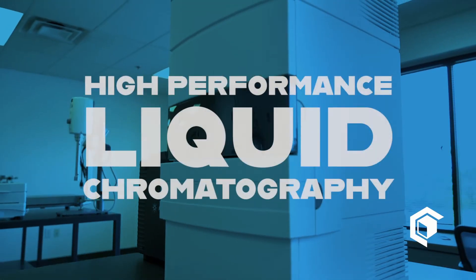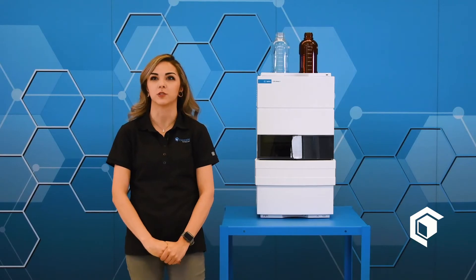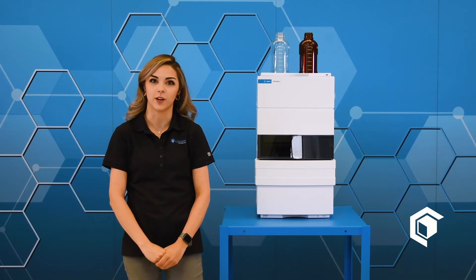The Agilent 1220 is a high-performance liquid chromatography system. Most labs prefer this method over gas chromatography because it doesn't require any heating and it provides more accurate content analysis.